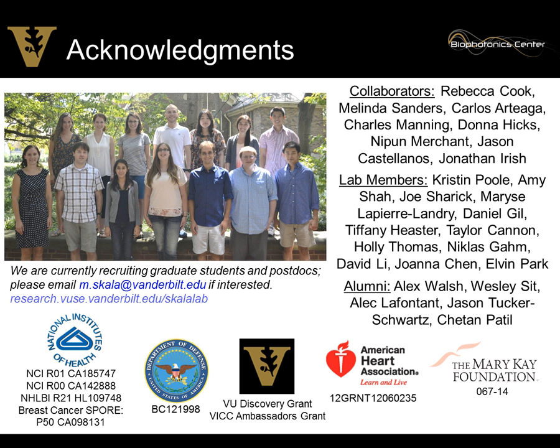Well, to put you on the spot, because we have a lot of LFD people here. What's LFD? Laboratory for Fluorescence Dynamics. Oh, okay. Can you compare the approach of multi-exponential decay and interpreting the fractional contribution to the phasor approach? And are you just not using phasor because we haven't converted you?